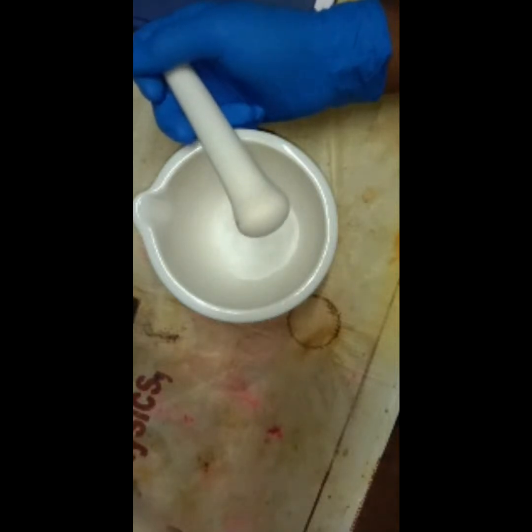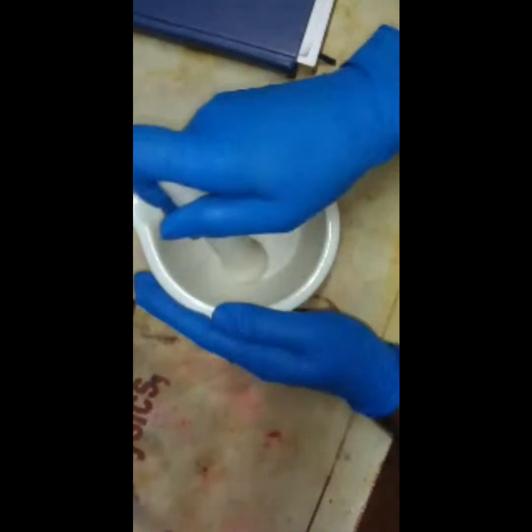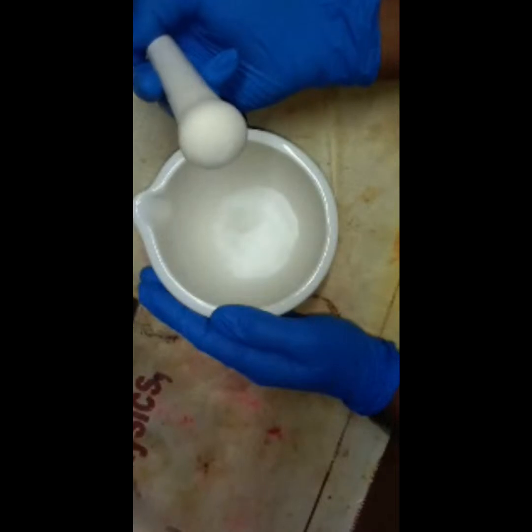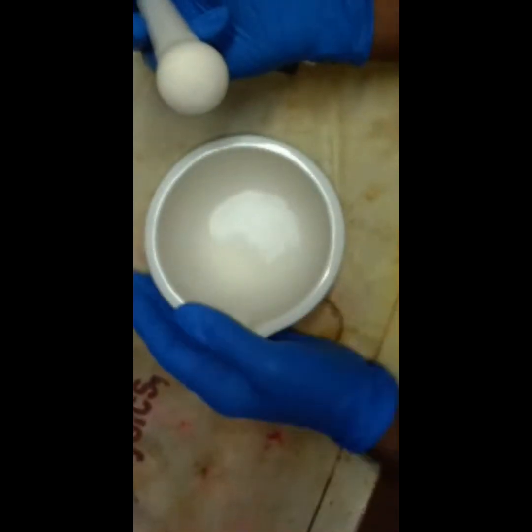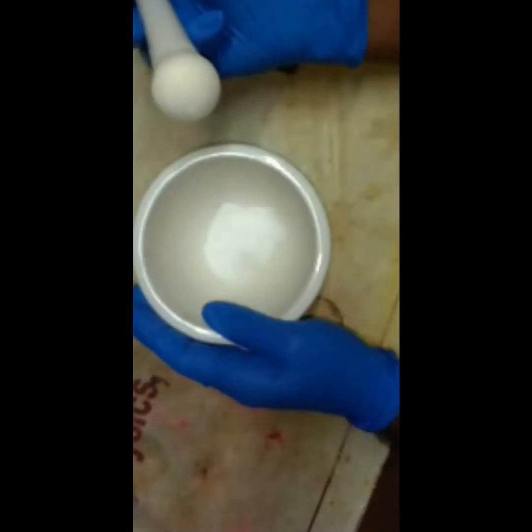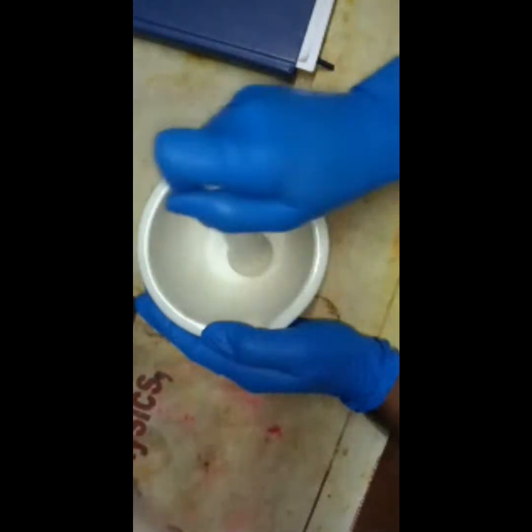What kind of image are we focusing on? The samples required are of small particle size, so this grinding is done to grind the samples. You can see and observe the particles.